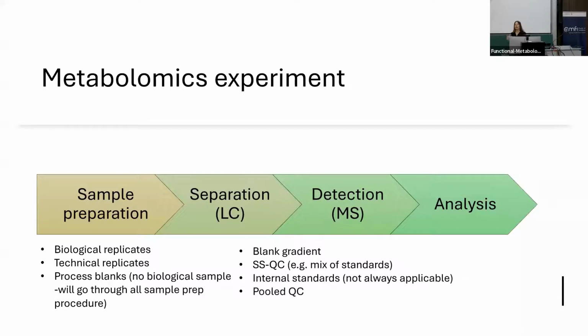Now, what both of them serve for is to check for any drift, either mass-to-charge drift or retention time drift within your data. And a pooled QC would be basically just all your samples pooled in one vial. Then you can sub-aliquot that vial in different replicates and just inject them throughout your sequence quite a few times.